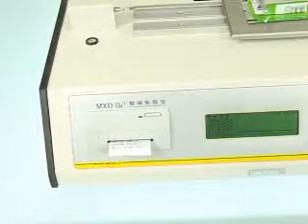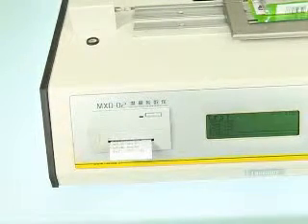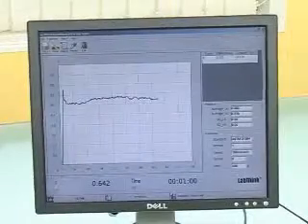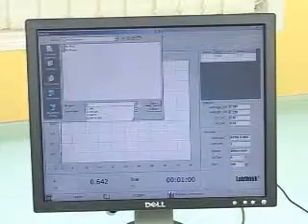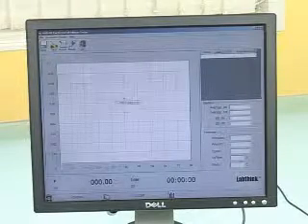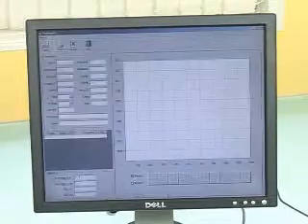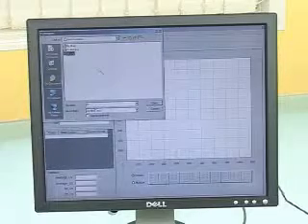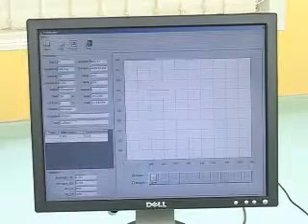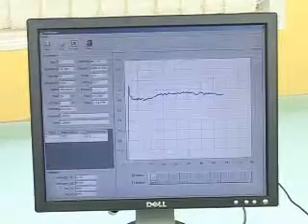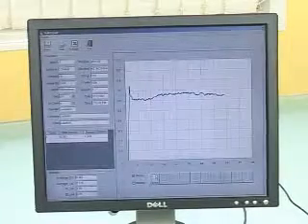Print out the test result or analyze it using the software. Take care when handling. Test ends.